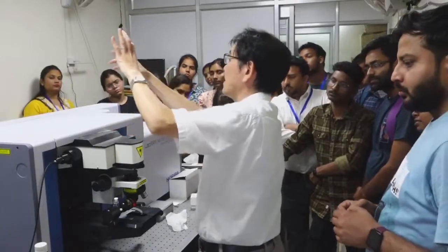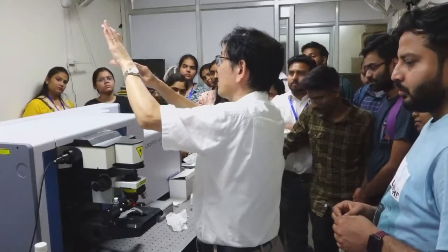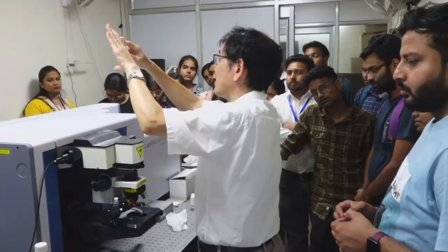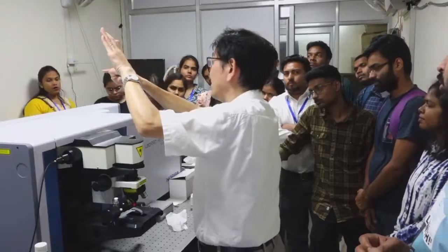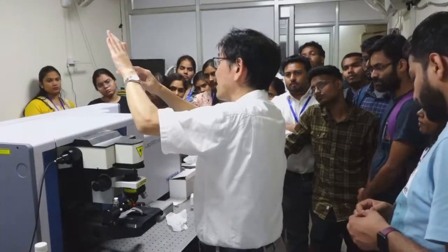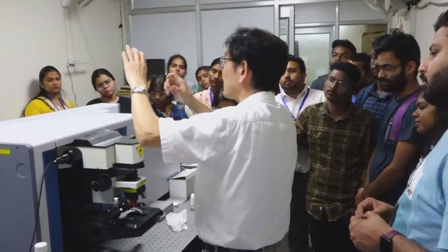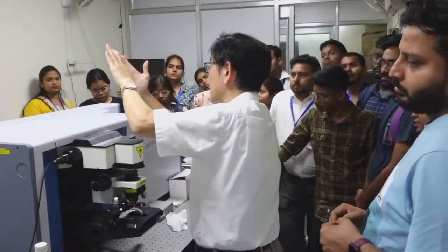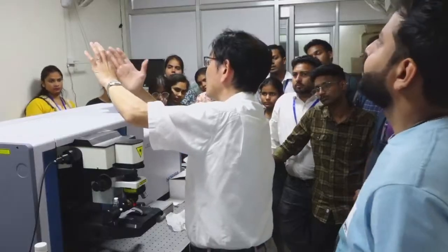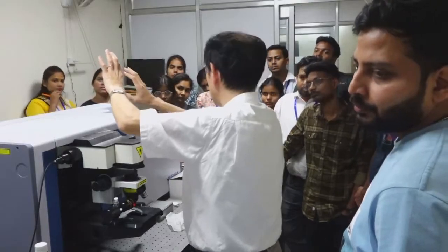When I express a spectrum, the vertical axis is the transmittance and the horizontal axis is wavelength. Then transmittance is 100, 100, 100, 100, and suddenly becomes 0, 0, 0, 0. Reflectance is accordingly 0, 0, 0, 0, and suddenly 100%. So the center is the cut-off wavelength. This element is transparent below the cut-off wavelength and serves as a mirror above the cut-off wavelength.